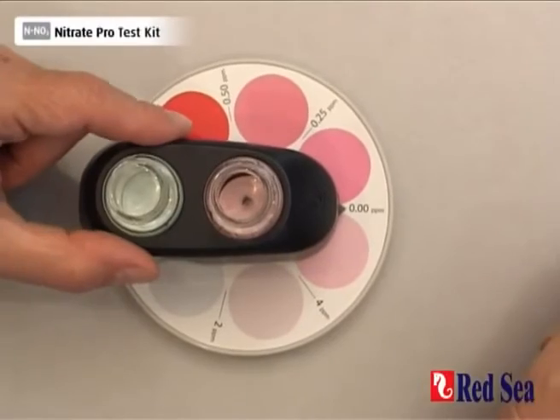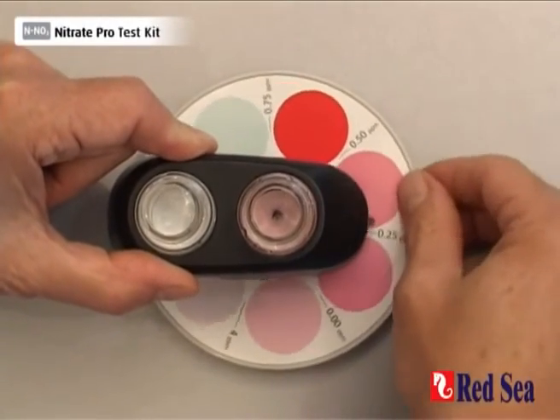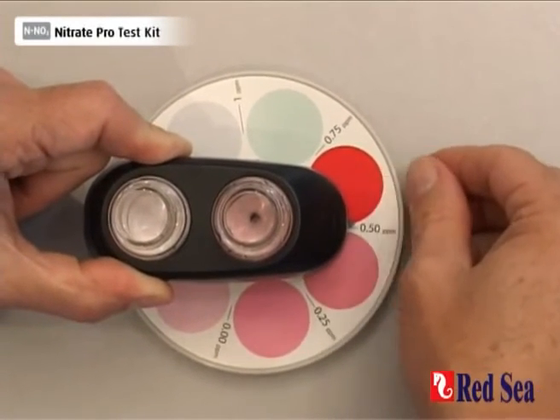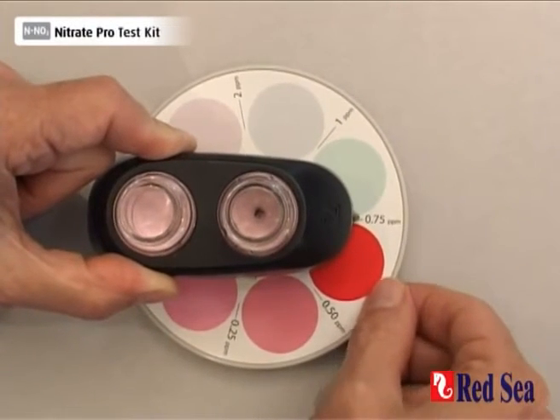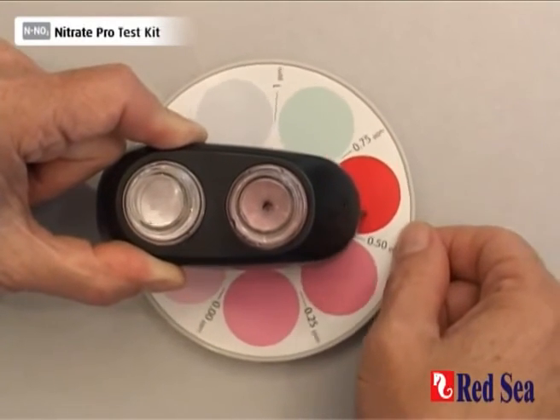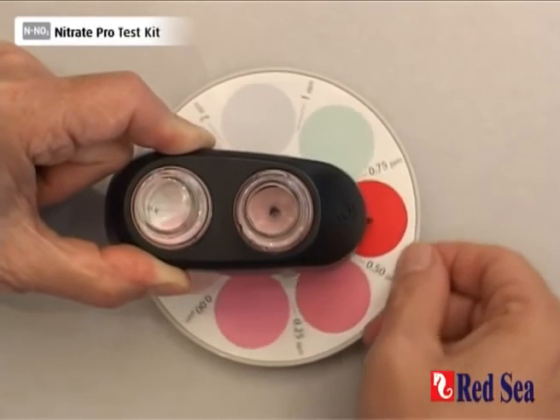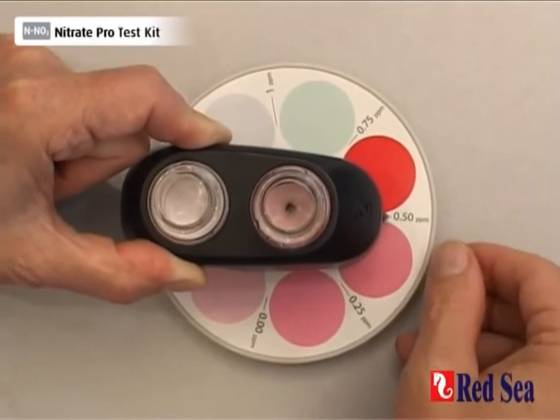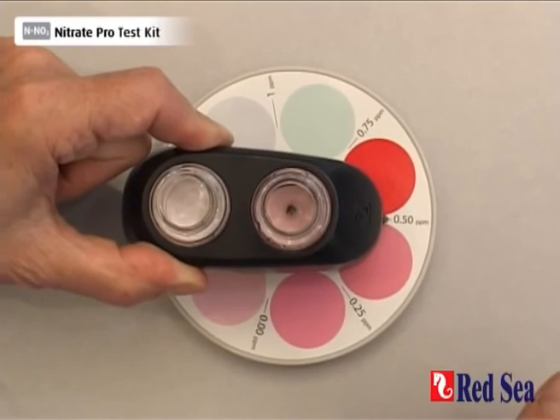We've waited our nine minutes and now we just have to rotate the color disc until we get our color match. We can see that we are a little bit pinker than the 0.5, but not quite as pink as the 0.75. So our actual nitrate reading is somewhere in between — around 0.6. That's the end of the nitrate test.